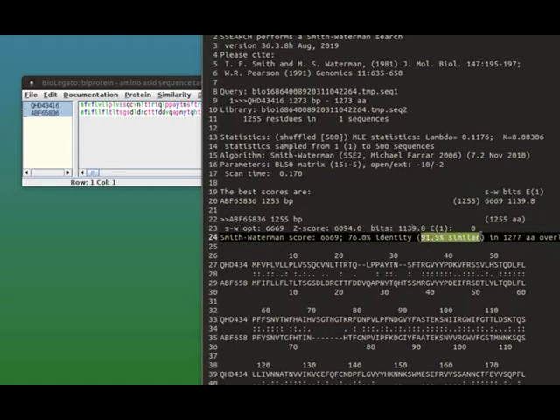91.5% similar. Now the difference is that similarity is taking into account conservative amino acid replacements. So the conservative replacements contribute more to the score than more extreme replacements. And so we have an alignment here which shows us conservative replacements and somewhat less conservative ones, and then finally gaps which are inserted by the program to make similar amino acids line up.